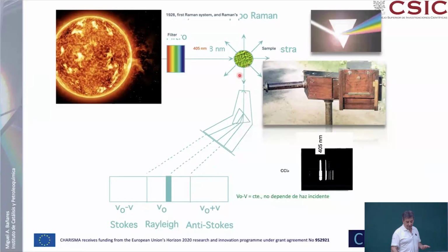Typically, he places it 90 degrees, because scattering goes in every direction, but just imagine when someone is using water flowing against a surface. Most of the water is going to the sides. Typically, 90 degrees is where you get most of the scattering. So basically, if the light is coming in this direction, light will scatter in every direction, but preferentially perpendicular. And because of that, he was perpendicular from the sun to the sample, and he was collecting here.